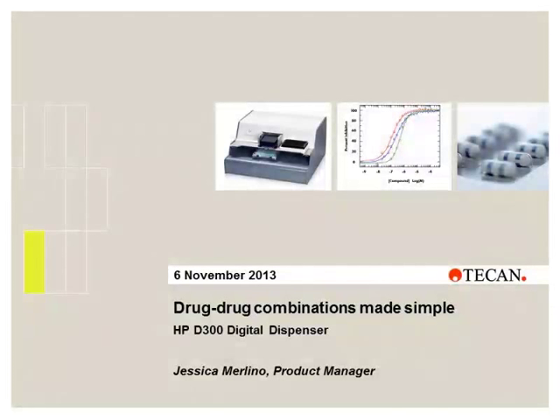So screening drug combinations in vitro has become more and more interesting to researchers as they search for the best treatments for many diseases, which includes cancer. At the Netherlands Cancer Institute Robotics Screening Center, the NRSC, potential drug combinations that either restore or enhance clinical response are selected based on large-scale genomic screening projects combined with genomic data sets.